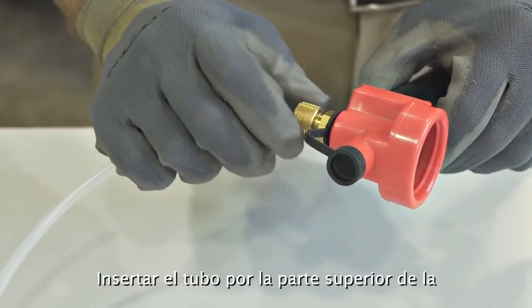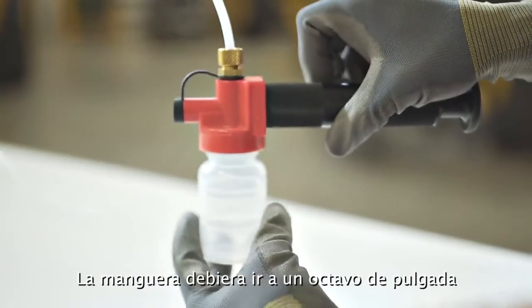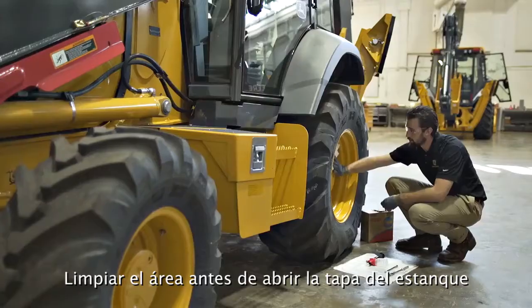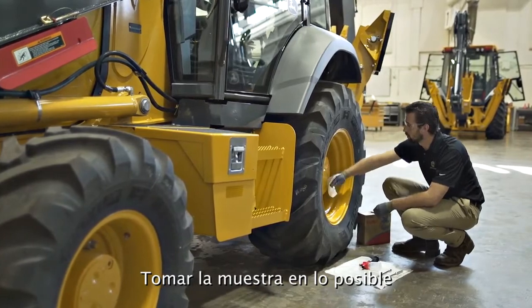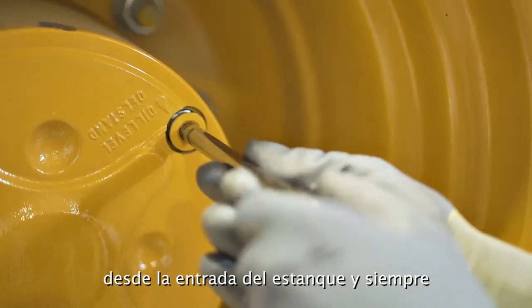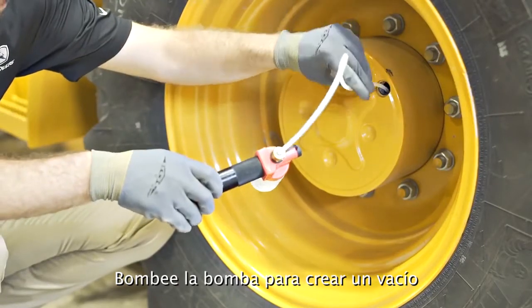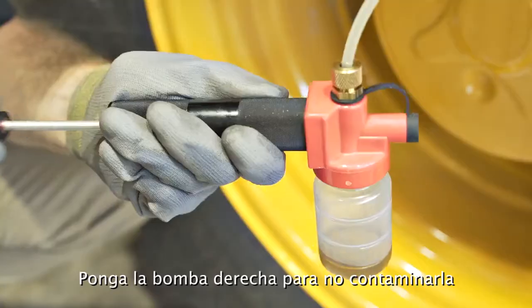Insert the tubing through the head of the vacuum pump and tighten the retaining nut. The tubing should extend about 1/8 of an inch beyond the base of the vacuum pump head. Clean the area before opening the reservoir access. Sample from the inlet side of the reservoir if possible, and always sample from the same fluid level. Pump the vacuum pump handle to create a vacuum. Hold the pump upright to avoid oil from contaminating the pump.